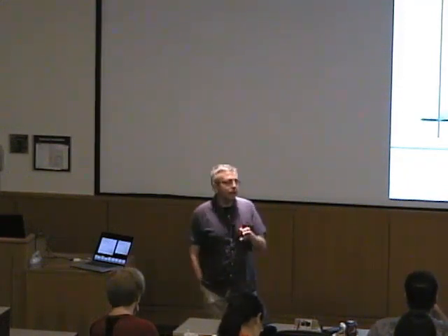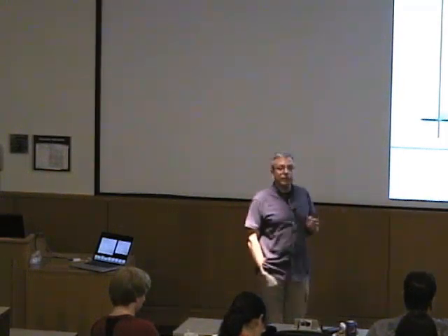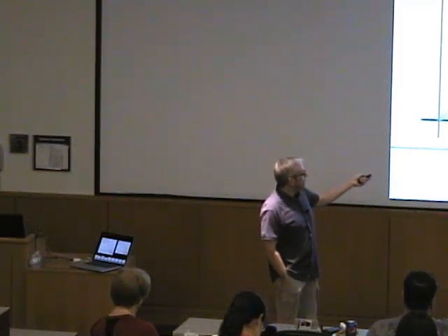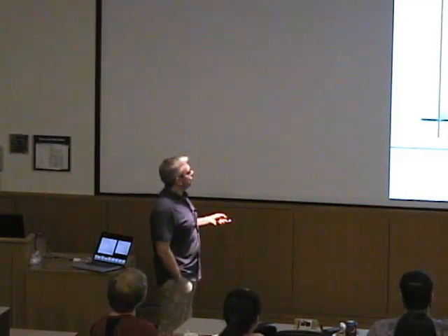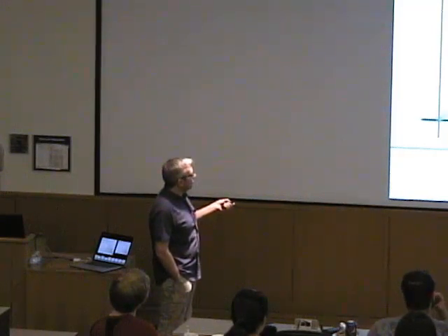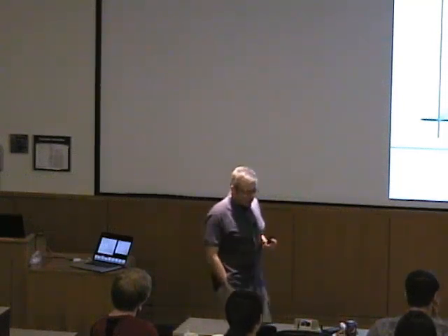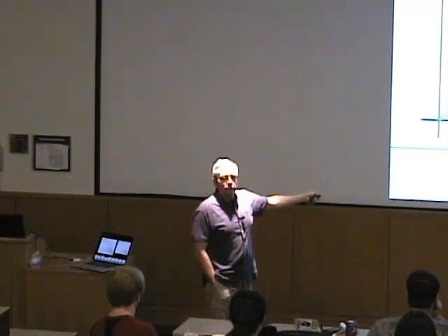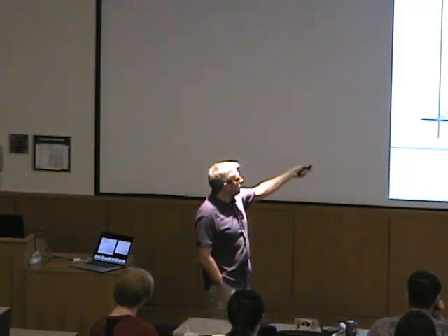So if there is a way to find those few irons, then of course we could calculate their positions, and if we have their positions, we could determine both the phase angle and the amplitude for each reflection, because Fourier transforms work both ways. It's not really what we want, actually, because in principle what we want is FP. We want to have, or FPH, so we want to have one of those that we cannot determine easily. But the trick is now the following. This so-called phase triangle must be true for every reflection. And you get this information while you don't get those two.